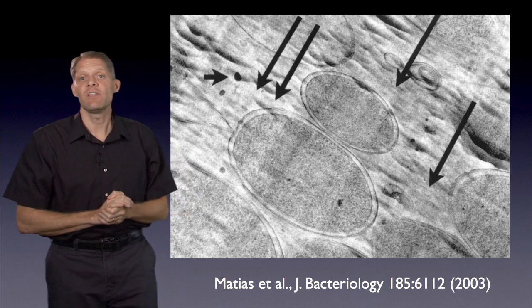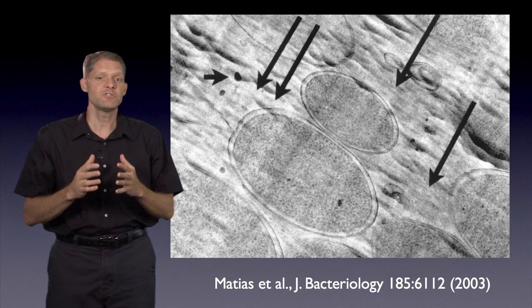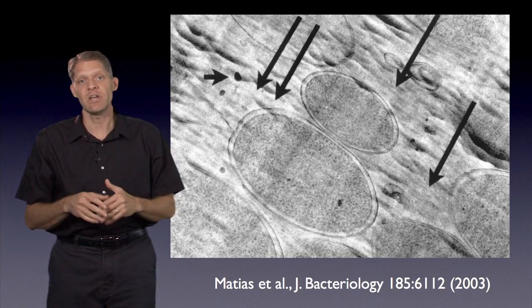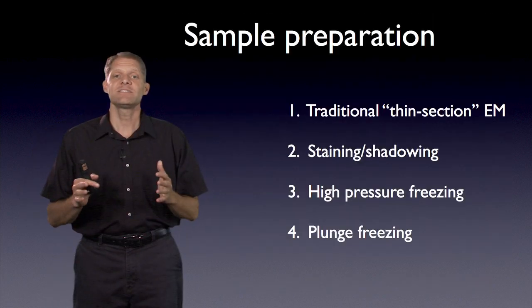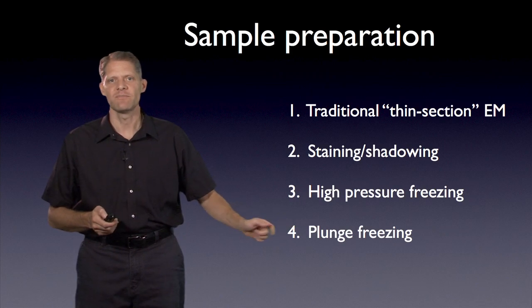Nevertheless, this allows us to obtain images of frozen material without chemical fixatives or stains or any plastic embedding. The last sample preparation technique that we'll talk about is plunge freezing.